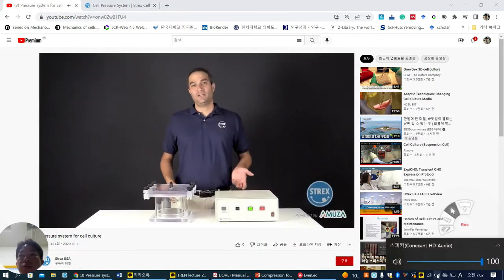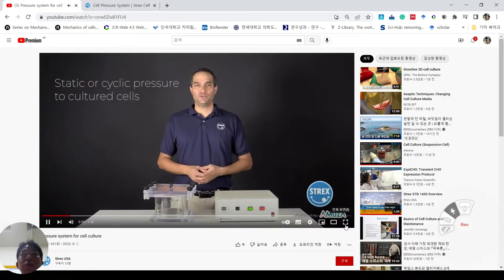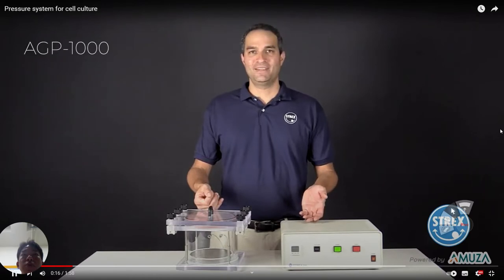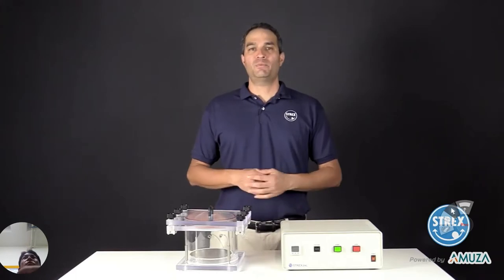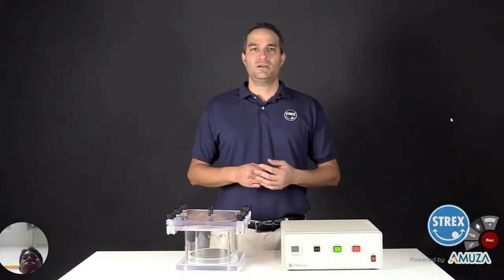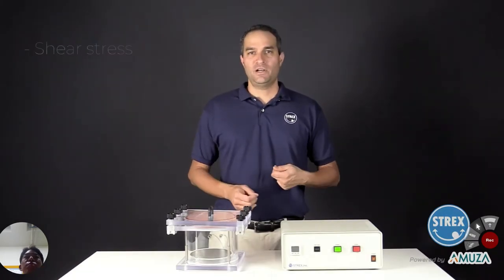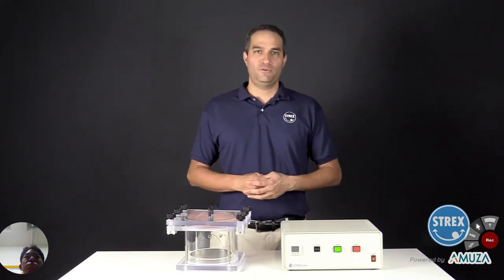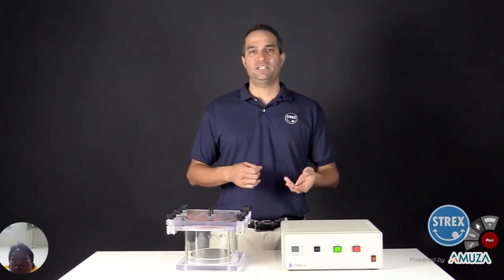Hi, my name is Derek from Strex. Today I'm going to show you how to apply static or cyclic pressure to cultured cells using the Strex pressure system called AGP-1000. This allows researchers to mimic hydraulic pressure in vitro, which gives a better representation of physiological conditions on the benchtop. Since cells are constantly exposed to dynamic forces in their natural environment, like shear stress, mechanical strain, and hydrostatic pressure, it's important for researchers to understand how cells respond to these stimuli and differentiate between them.